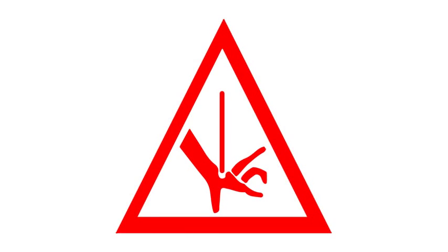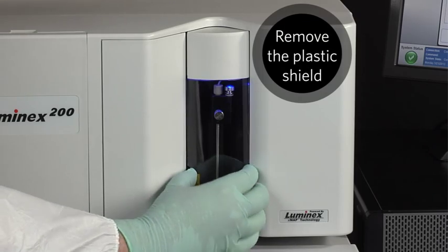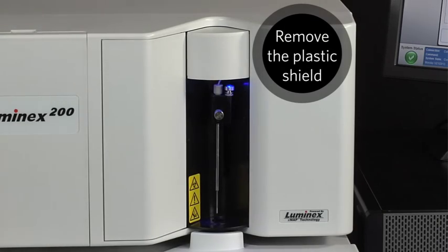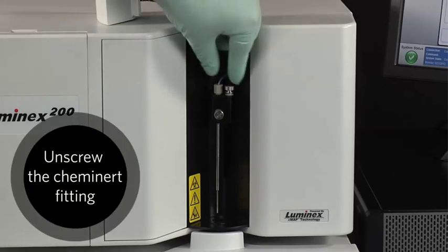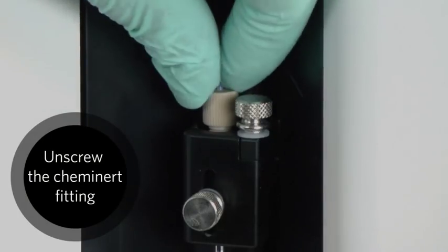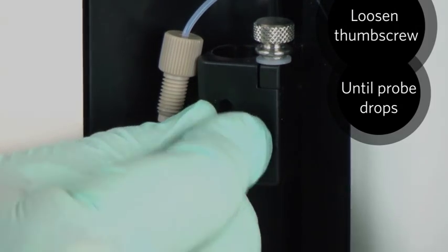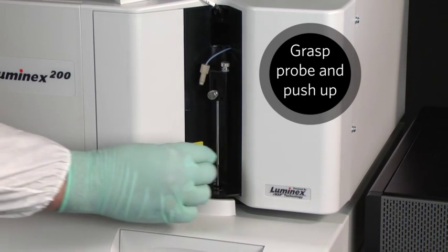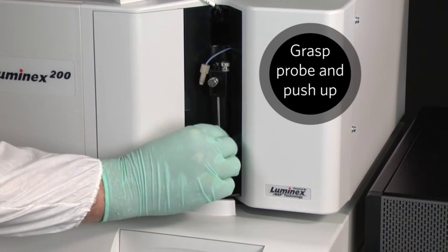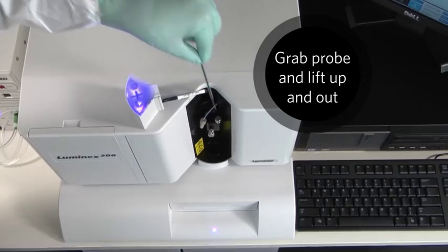For safety reasons, you must always check to be sure the instrument is not performing any operations before removing the sample probe. Remove the plastic shield that covers the sample probe area. Remove the light housing. Then unscrew the Caminert fitting on top of the sample arm. Loosen the thumb screw on the front of the probe arm until the probe drops. Next, grasp the probe and push it up through the top of the sample arm. Grab the top of the probe and lift it out of the instrument.